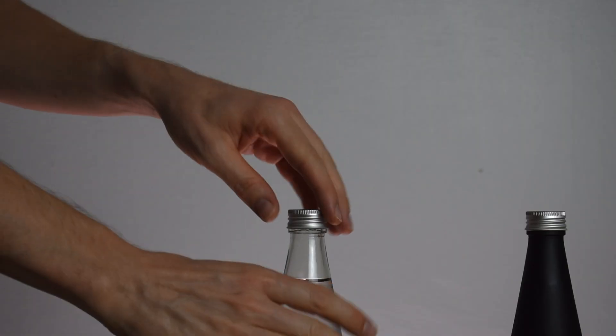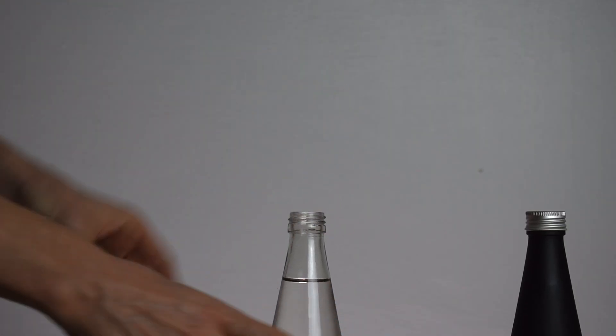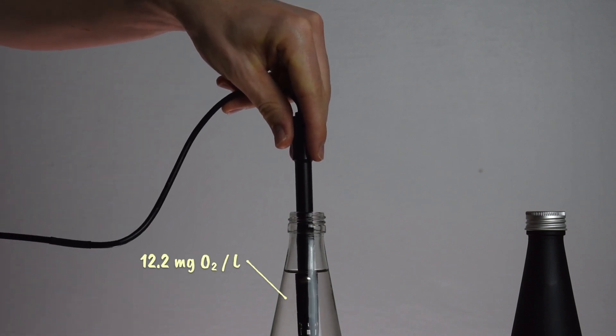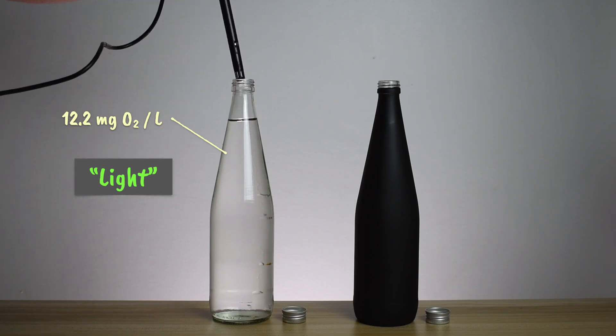After the time has passed, open the first bottle and record the new dissolved oxygen level. Here, we've got 12.2 milligrams of oxygen per litre. We'll call this value light, since it's from the bottle exposed to sunlight.